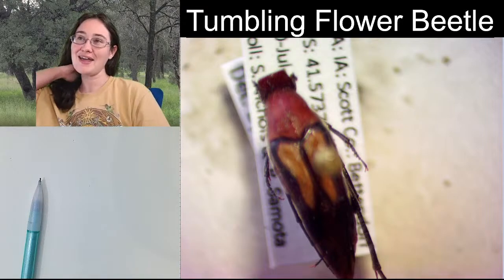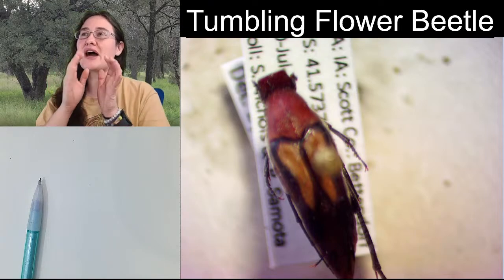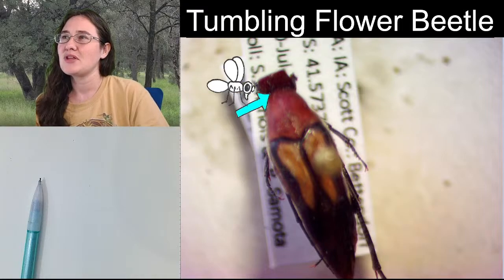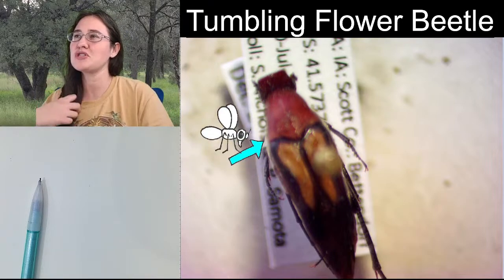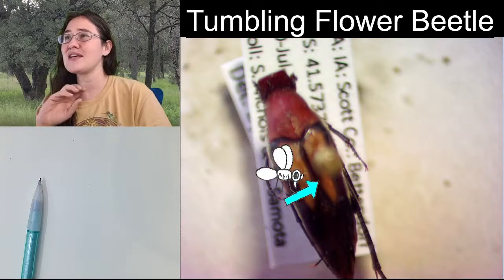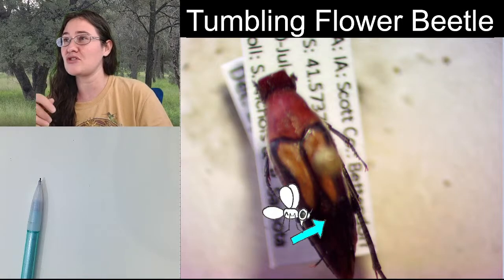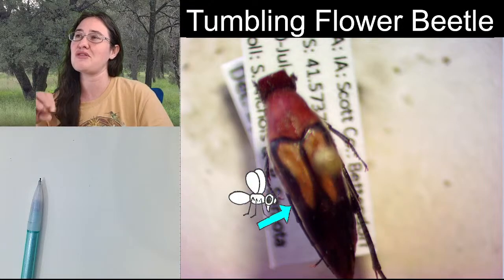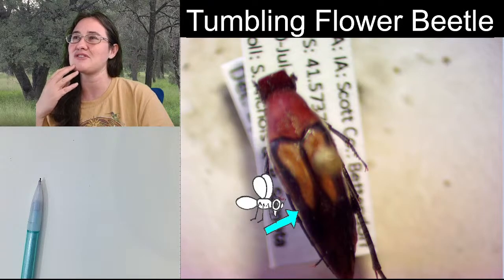Now, I love these beetles for their really odd shape. From the top, he looks really narrow. You've got the head, this would be the pronotum, or that first segment of the thorax, and then these orange and black guys to about here, these are the elytra, or the first pair of wings. This beetle does have the ability to fly, he has membranous wings underneath those, but they're not full length. You can see the rest of his abdomen underneath. And he's this kind of perfect tumbling shape, so he'll sit on the edge of flowers, and then they tumble off.